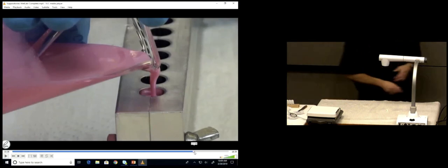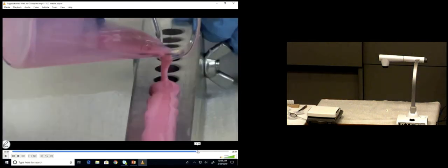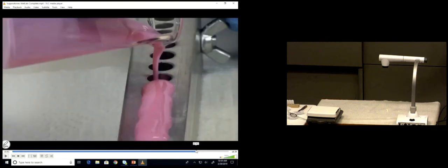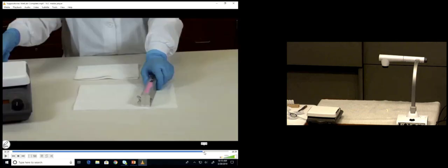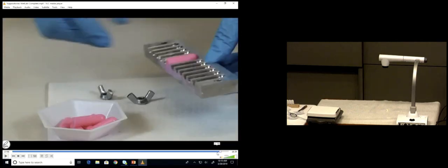So remember, as you pour through these, make sure you go back and forth for the first 6, and back and forth until they look like that. See what I'm saying? To where it's spilled out like a mushroom all the way across on all the different sides. And then try to do one more at a time. And then maybe one more at a time. It doesn't do you any good to have a partially filled mold. If you're not going to have enough goo to fill up a full one overfilled, then just use that to overfill the remaining ones. Okay? So get 6 really good, and then one more at a time until you can do it. Wait for the time, same sort of trim, and you're going to essentially then put them in there, give me an average weight, and that's it.